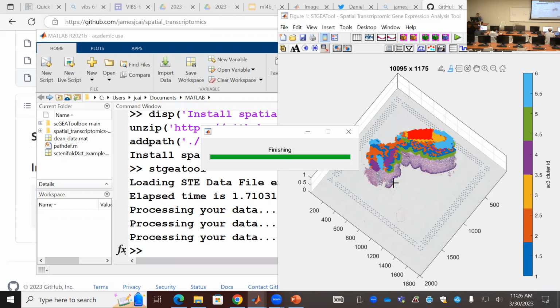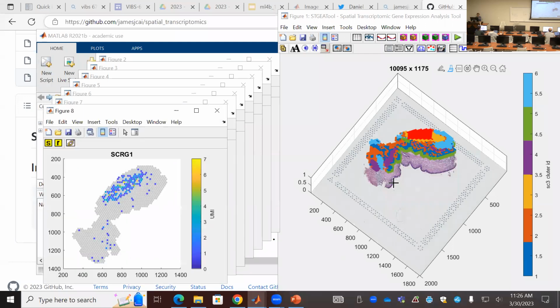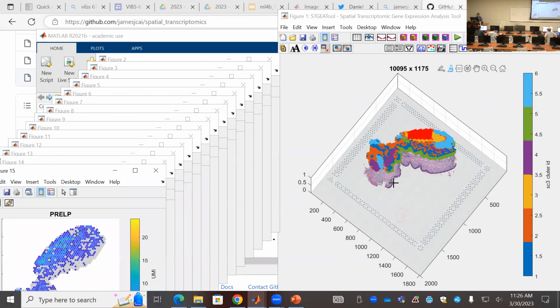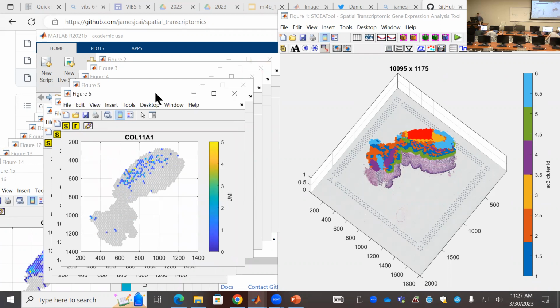Then you should identify those genes highly expressed in the region you selected out of these 10,000 genes. It's the same function I used in the single cell data. Once you know those genes, collagen, you get some idea about this collagen tissue part of this. There are at least 2 collagens in there.